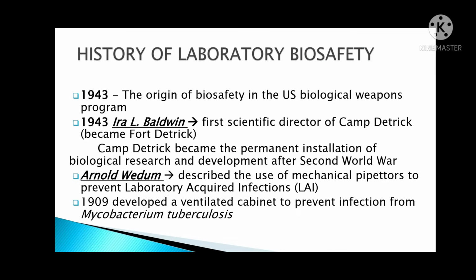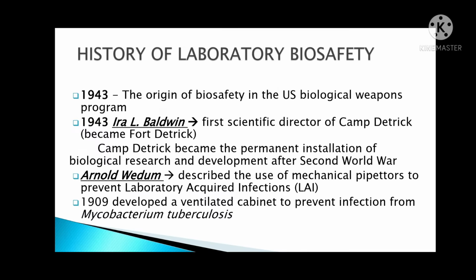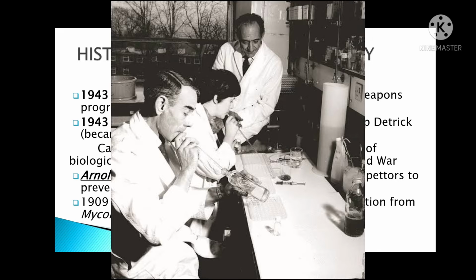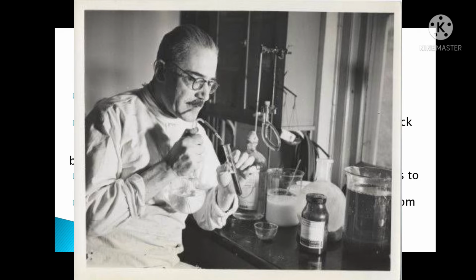For me, this is considered a breakthrough also in the practice of medical technology, since medtechs or scientists before used to mouth pipette samples, so body fluids, either urine or any other body fluids collected from the patient, were mouth pipetted by laboratory scientists.